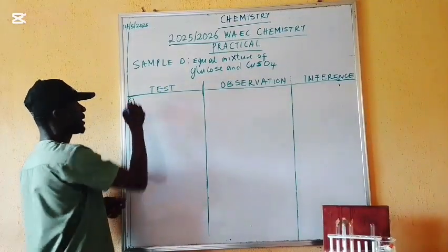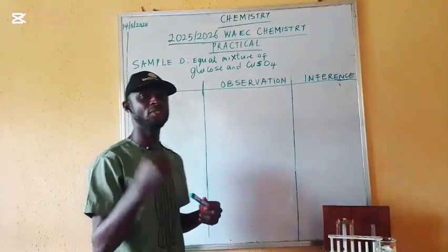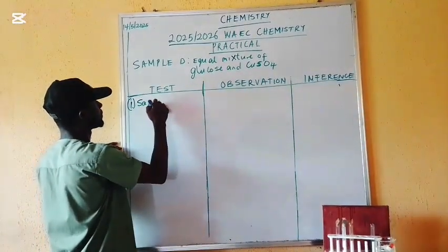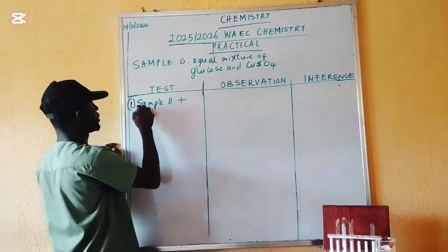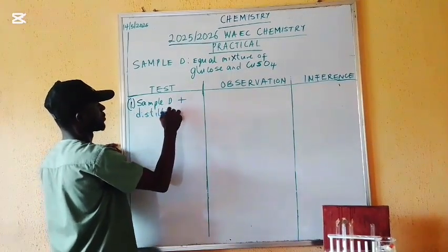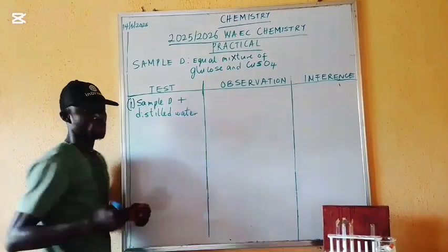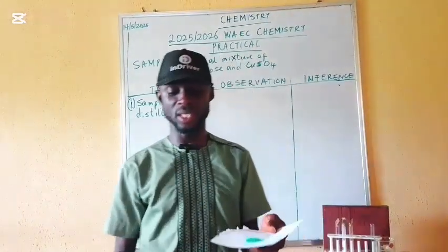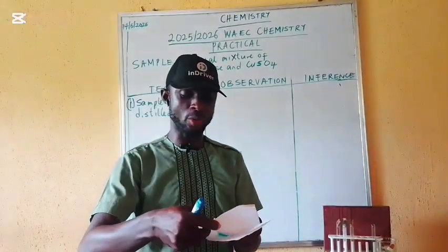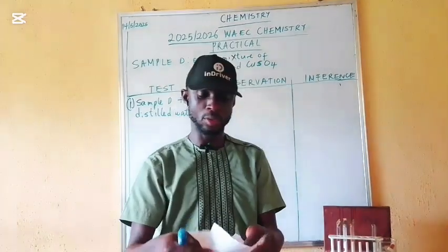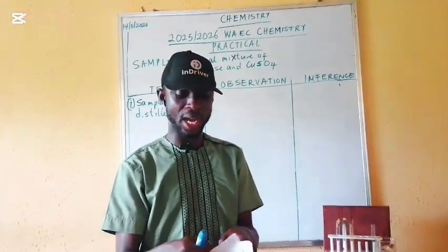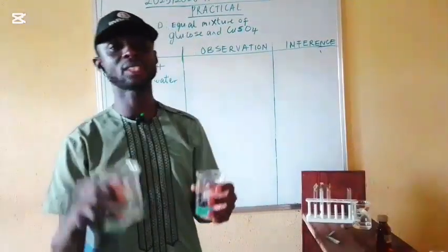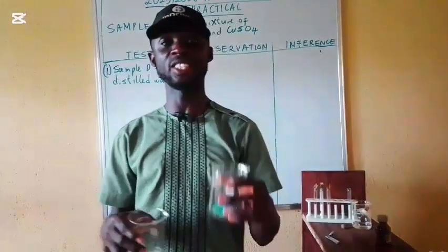The first test they may ask us to do is the addition of distilled water to our sample. So we write: Sample B plus distilled water. Let's add our water to our sample and look at the observation we are going to see.